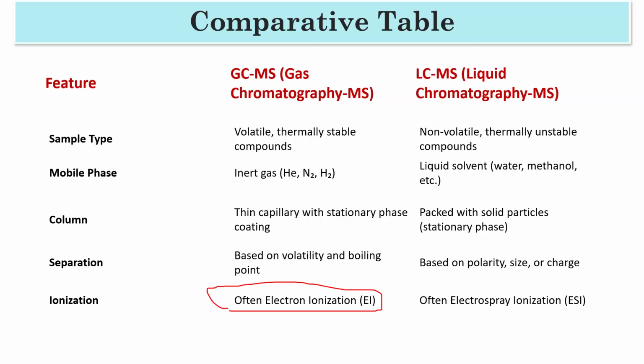But in LCMS, you will prefer electrospray ionization, because you can use it for large biomolecules also. It's like a sign that goes together with LCMS.